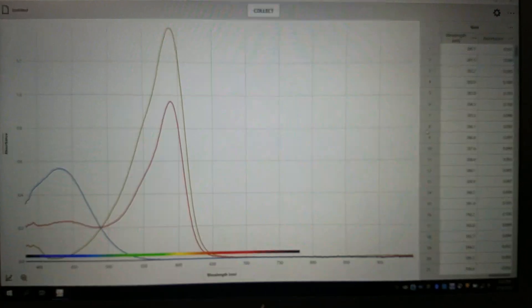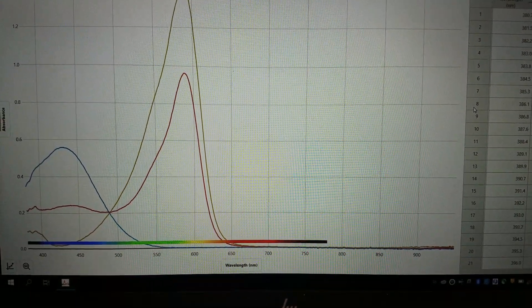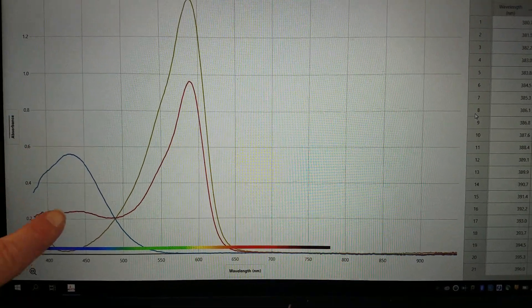Here is what our graphs look like. We can see our acidic peak, the buffer, and our basic peak.